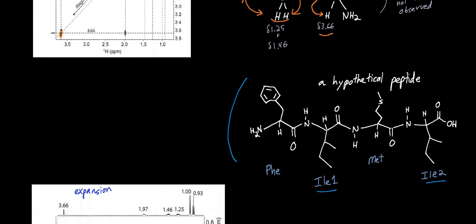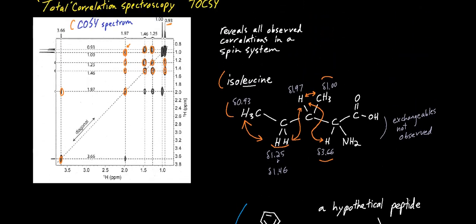Now, they're going to be very likely in different enough chemical environments that some of the signals will be more or less de-shielded. But basically, this is a peptide, drawn in a little bit different way, but basically what we've been looking at, all of these essentially aliphatic protons, in this whole region.